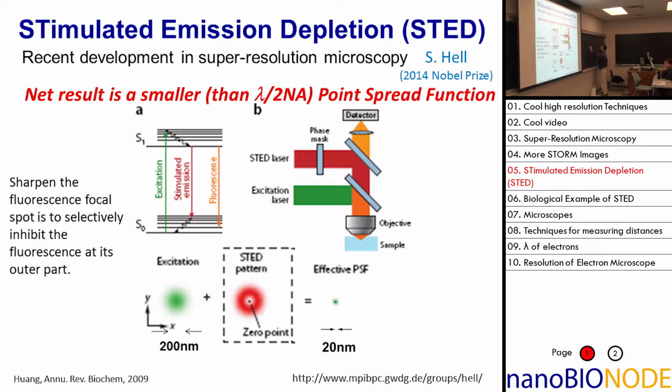And then this is out of phase, and these two destructively interfere. Why didn't, or how do you know you put the donut hole right on top of the emission source rather than way out here?